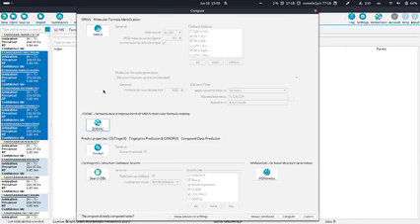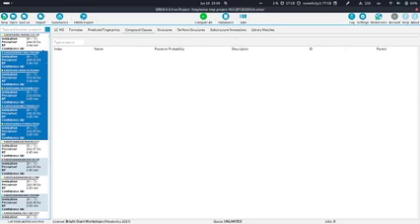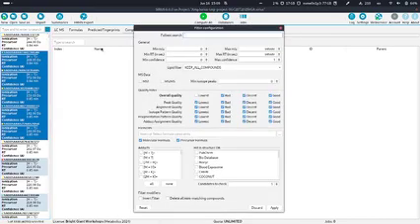When you apply the filter, you will remove all the data with that data quality, but will it not be able to be analyzed again, or will it be removed from the workspace? Yeah, I can show it again. There's two things you can do if you are in this filter window.